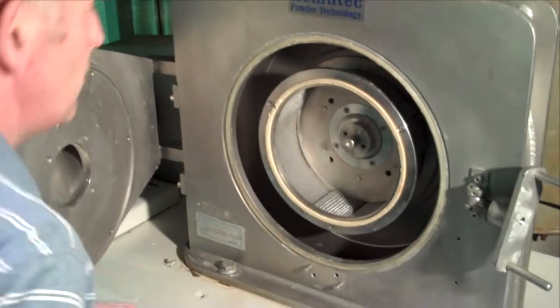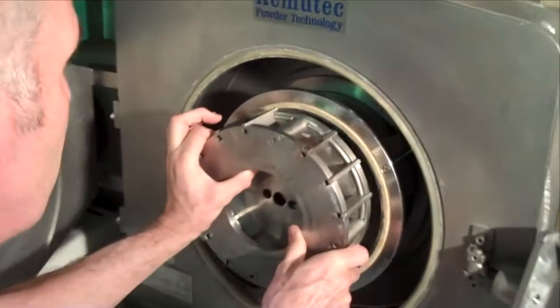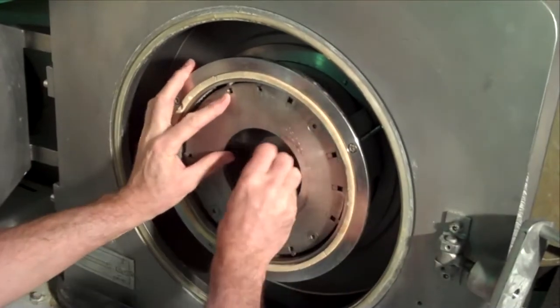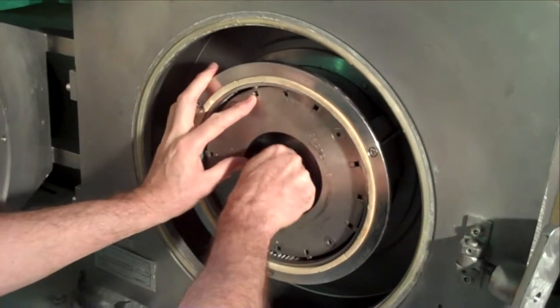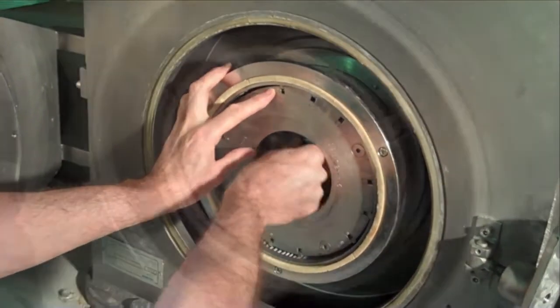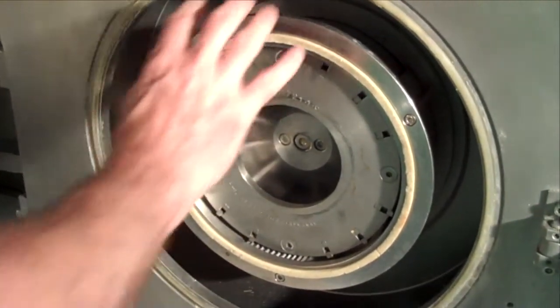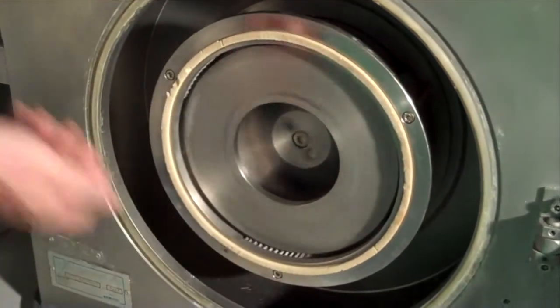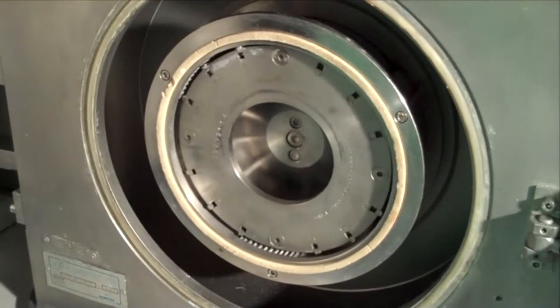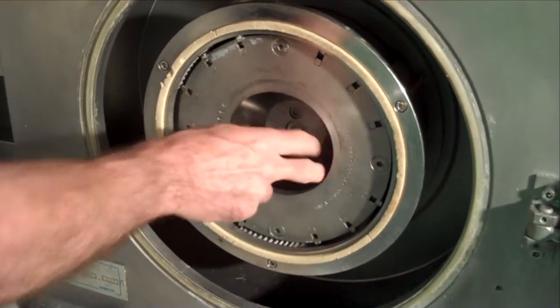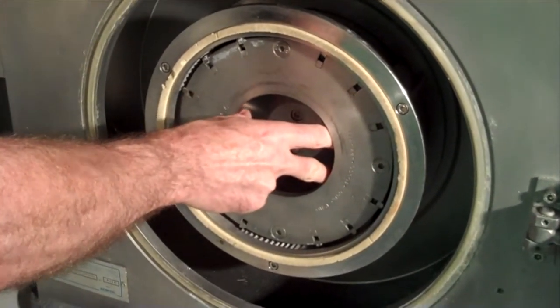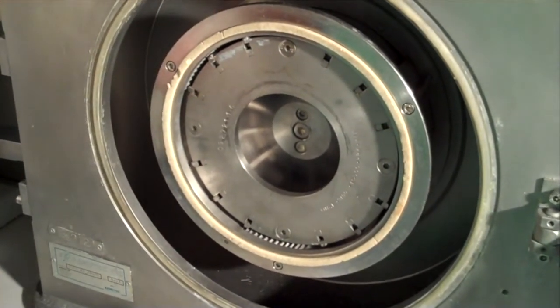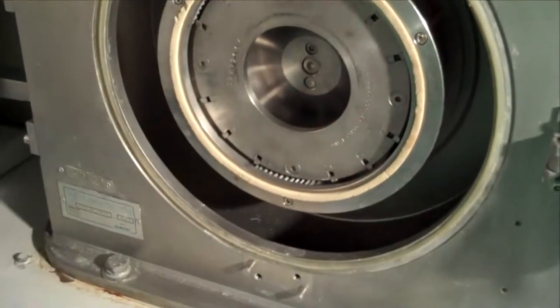It is then located with screws. The finished assembly operates with the fixed outer screen with the cutter blocks and the internal rotating turbine. Product enters into the eye of the mill through this hole from the inlet on the door, is ground, passes out past the screen assembly, and discharges below into the collection system.